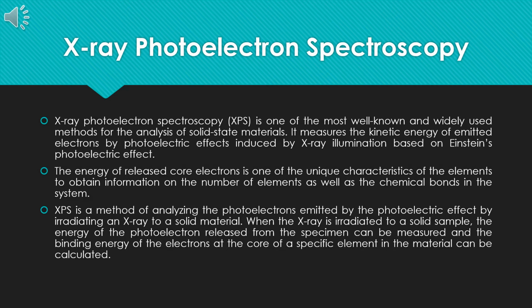XPS is a method of analyzing the photoelectrons emitted by the photoelectric effect by irradiating X-rays onto a solid material. When the X-ray is irradiated onto a solid sample, the energy of the photoelectrons released from the specimen can be measured, and the binding energy of the electron at the core of a specific element in the material can be calculated.